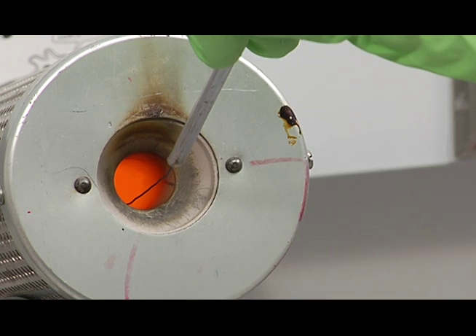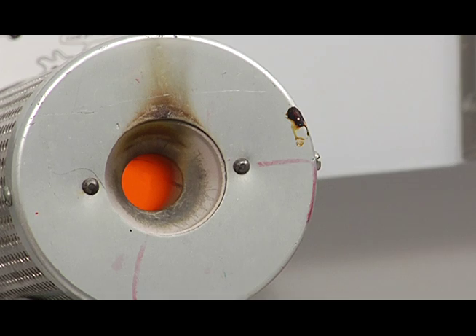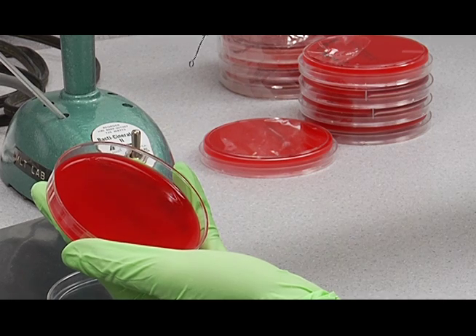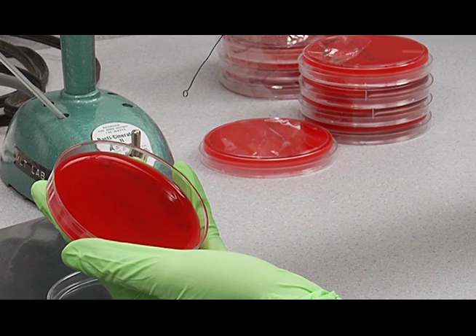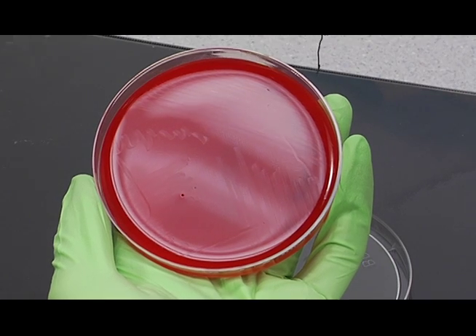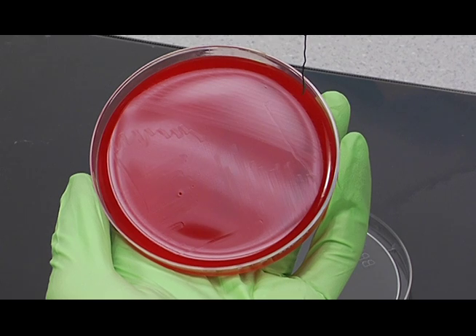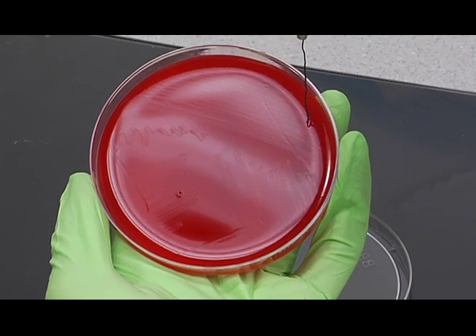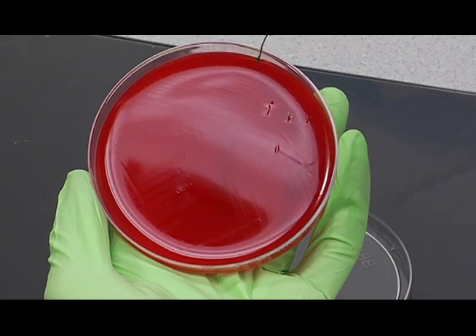And then we're going to flame the loop. And I'll show you how to stab this. To stab the plate, you want to angle the loop directly perpendicular to the plate. And then perpendicular to the streak lines. In this area, you're going to make three stabs parallel to each other, just like this. About that far apart.